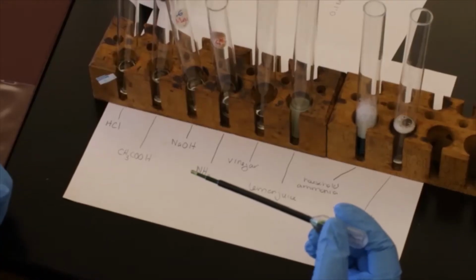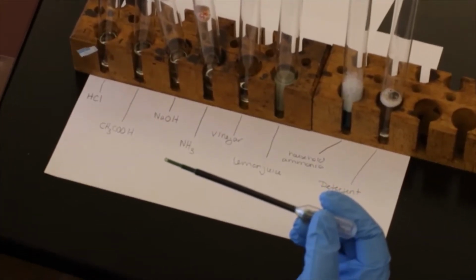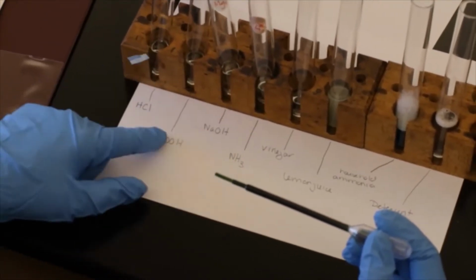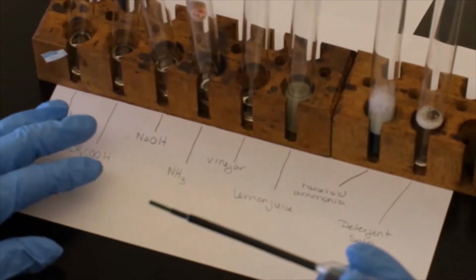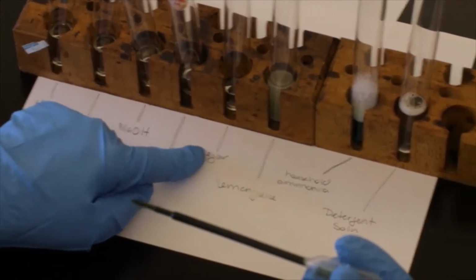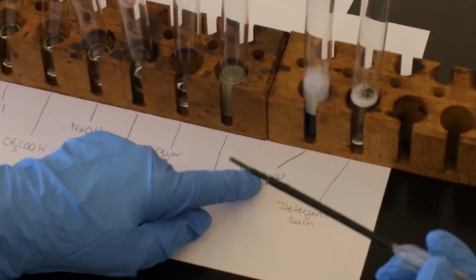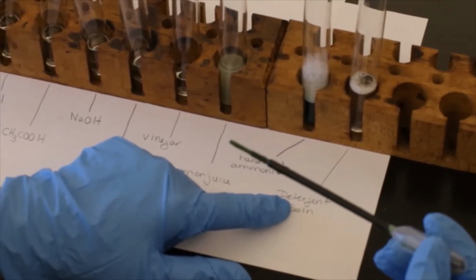This is the extension on part C where we're going to look and check the pH of solutions. So in front of you we have HCl, our acetic acid, NaOH, NH3, okay, and all of those are 0.01 molar. Then we have vinegar, lemon juice, household ammonia, in this case we used Windex, and our detergent solution, which we just used a lovely coconut hand soap.